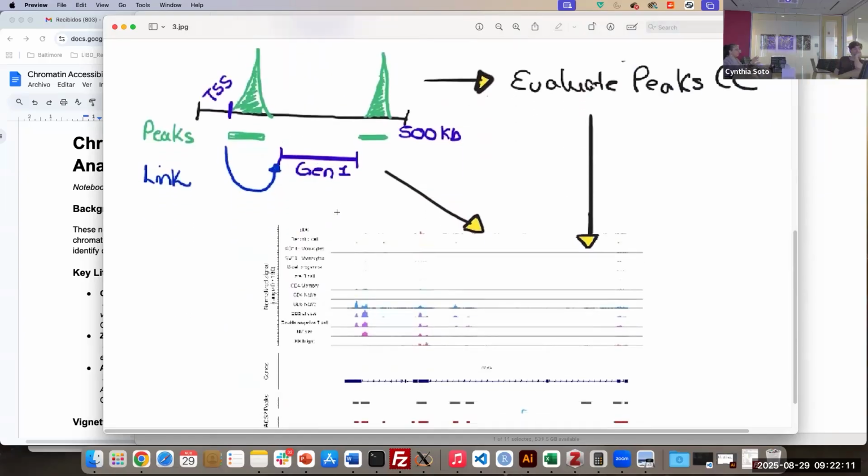One relevant thing to mention at this point, once you have your chromatin object and you can run all the other functions related with this analysis, is that it's not mentioned in many of the tutorials that you need to evaluate the peaks. Because you are going to have peaks there, but not all the peaks are high confidence peaks. So we need to be very careful to understand that not all the peaks that are there are really of the high quality that we need to run a specific analysis.